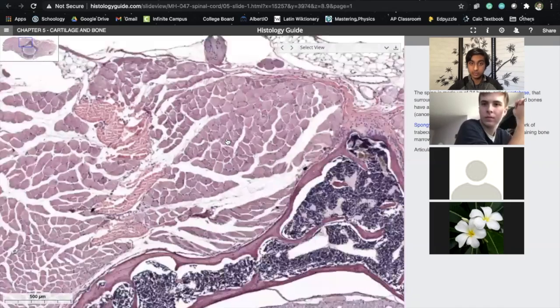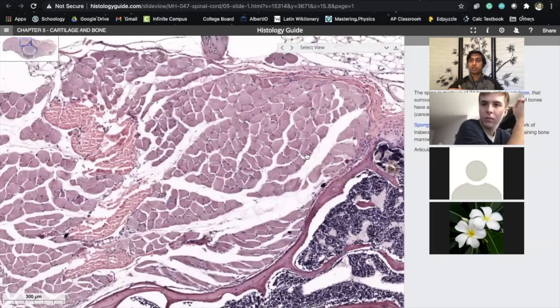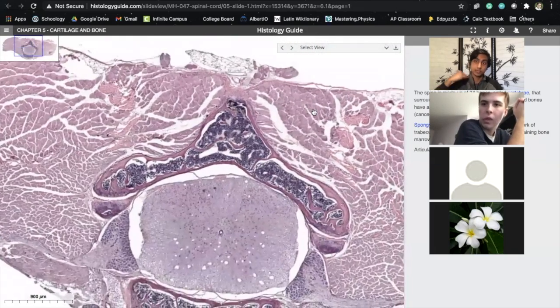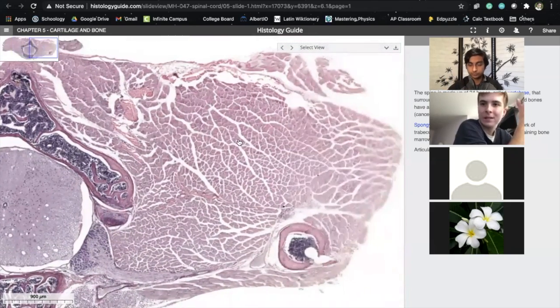And then out here, you have muscles and you have, think about your body, right? Think about, I can't remember, I think this is a cervical section. So right near your neck area of this tissue sample. And so you want to keep in mind, what is there? You have muscle, probably have fat.